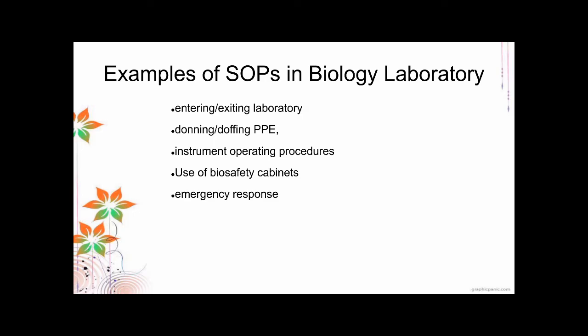And then what should be the proper response during an emergency? For example, there's a fire in the laboratory. Say, since you're using alcohol lamps, your sleeve accidentally caught on fire. What should you do? You should not run around like a headless chicken in the laboratory shouting fire. So what should be done when that happens? And then proper hand washing.